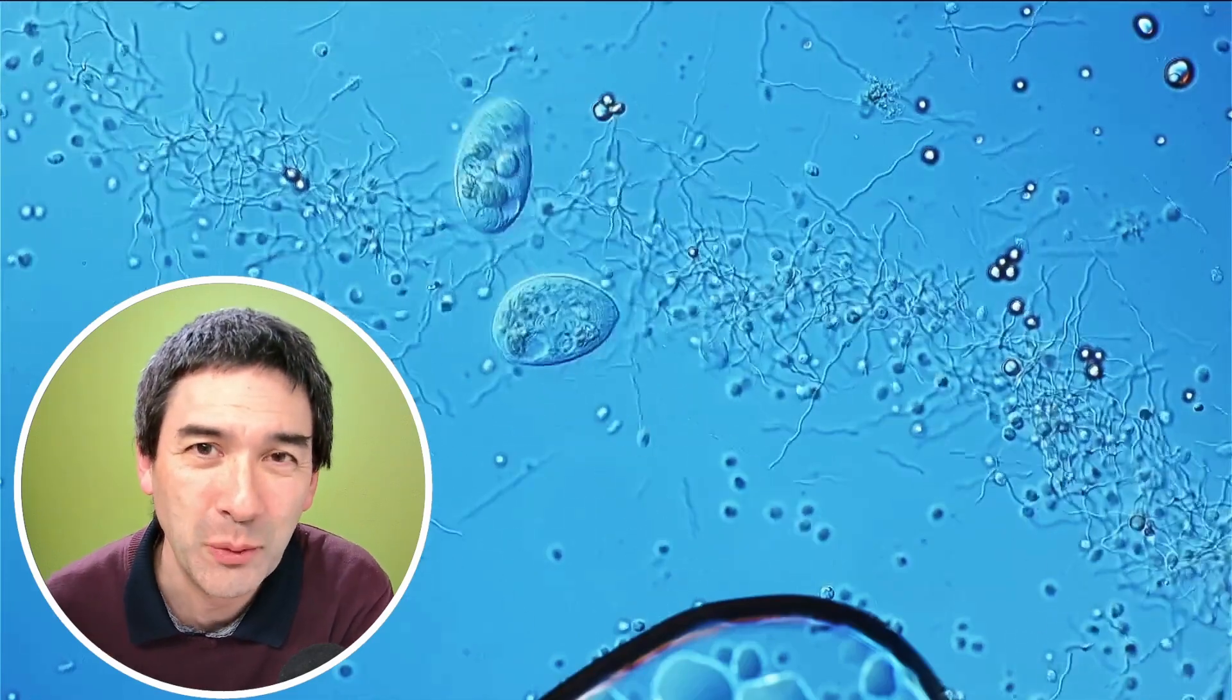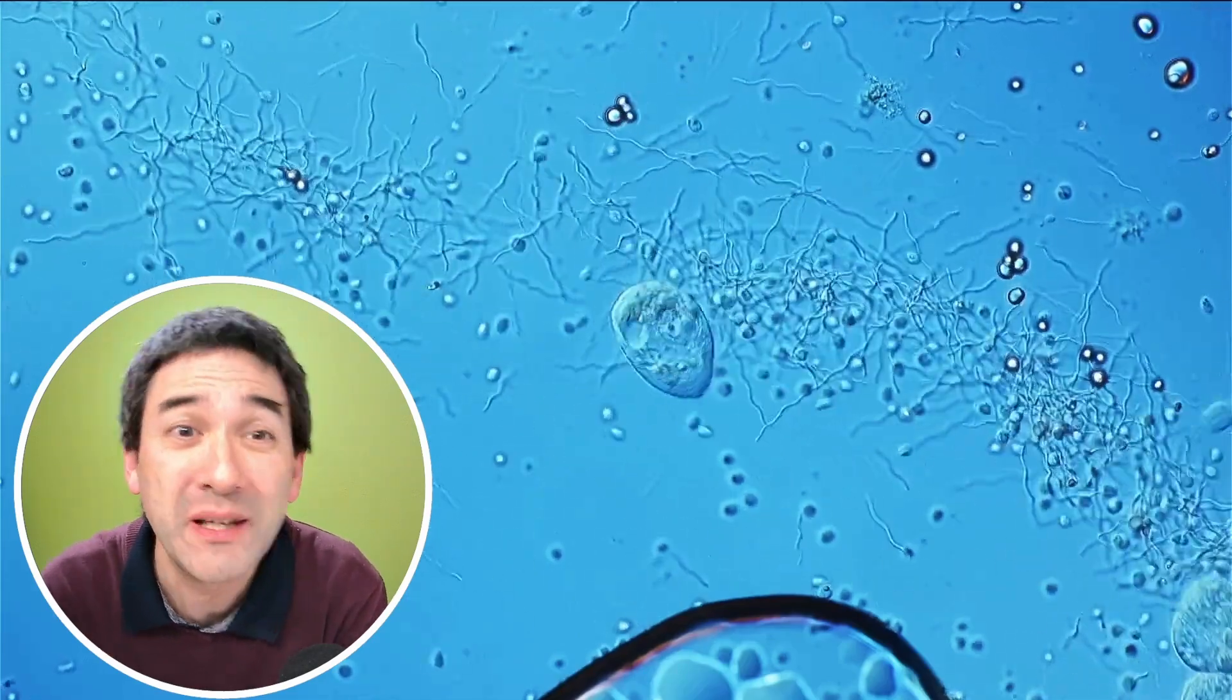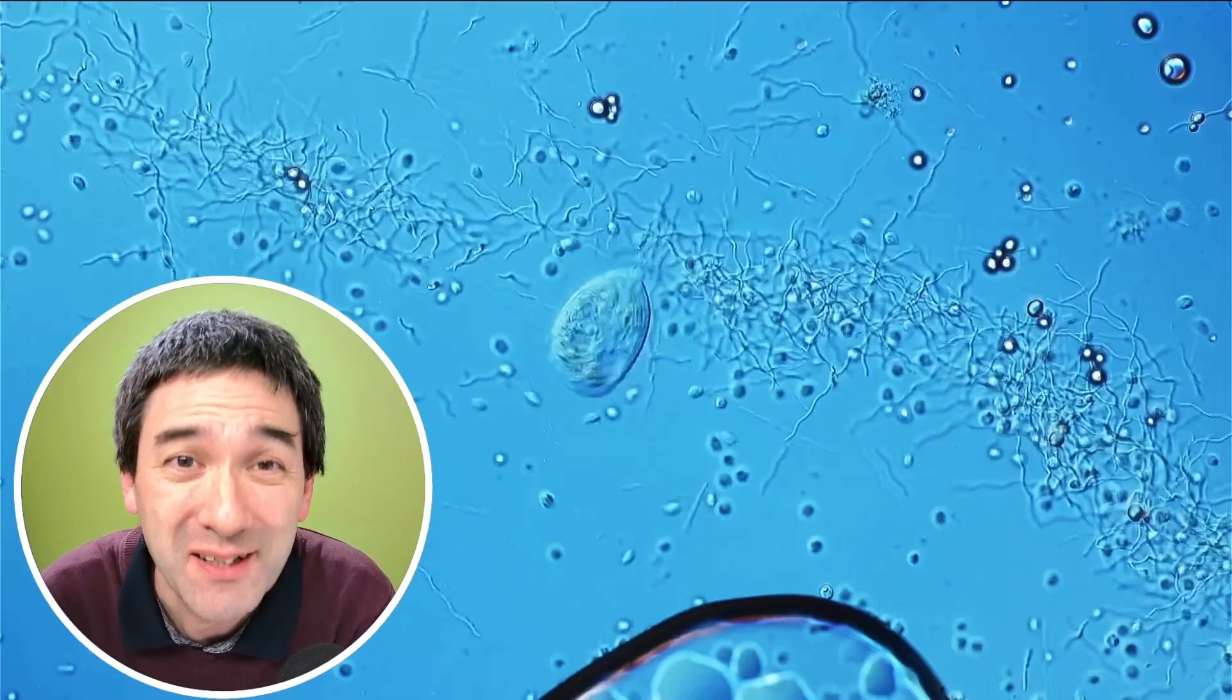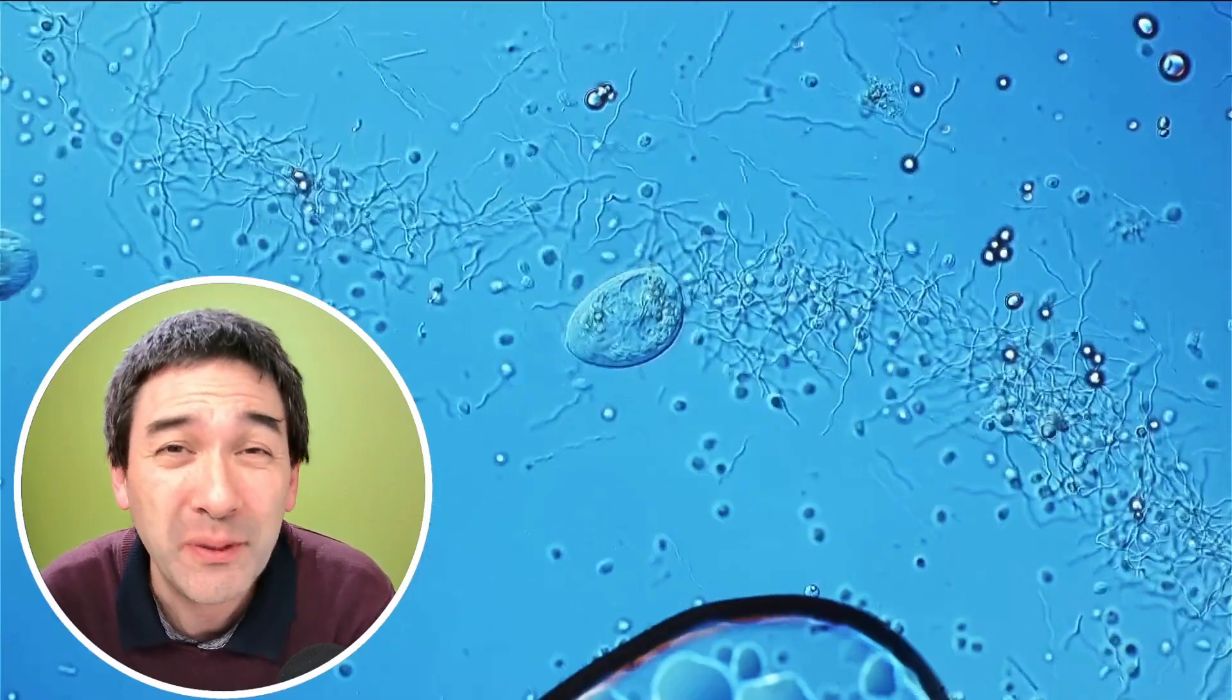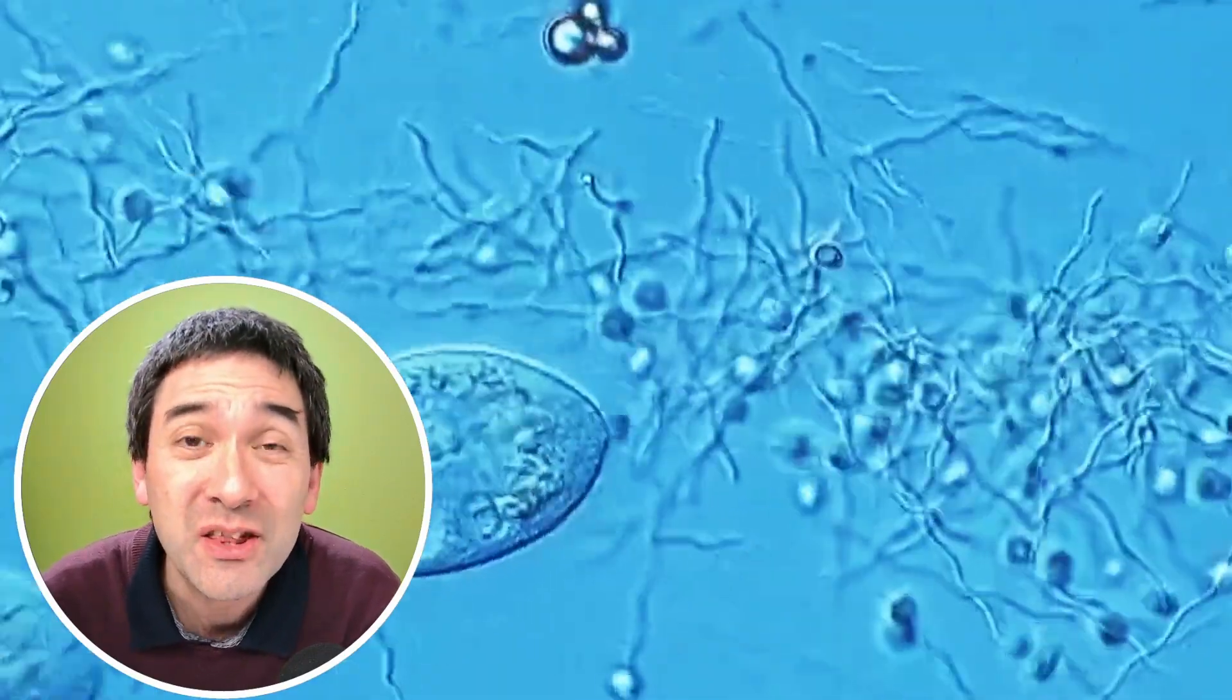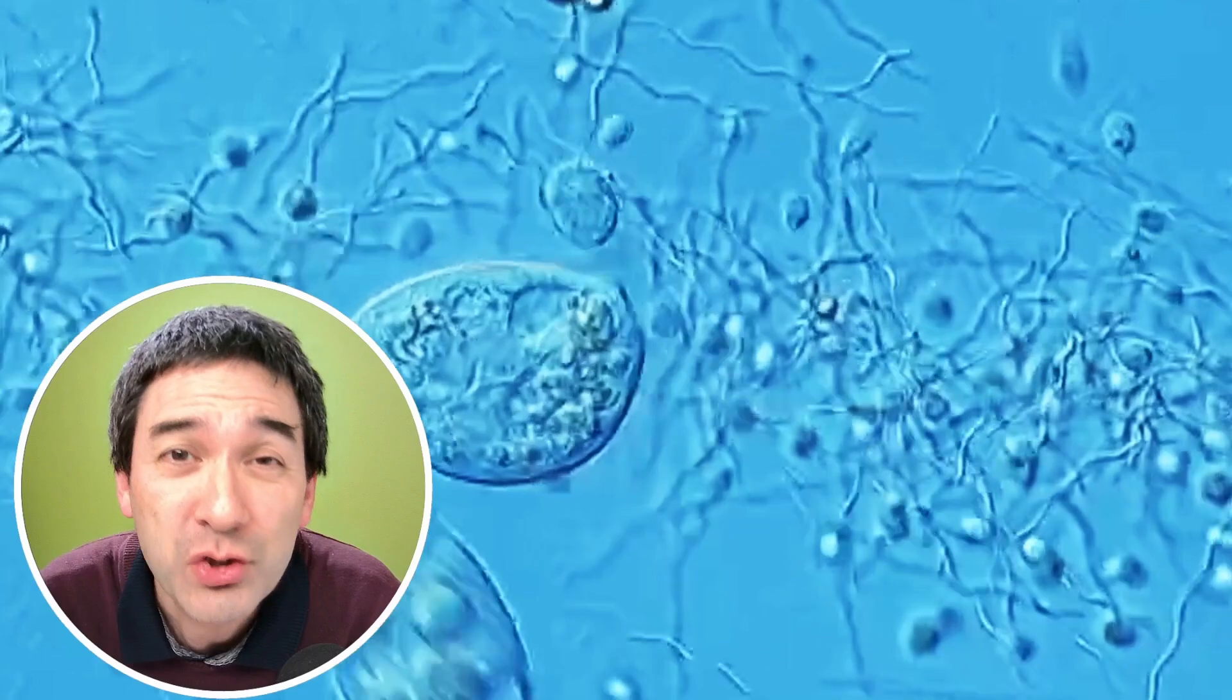Hi, Micropunter here again. Look what I found here. These are spirochetes, and I'm not talking about those big cells that you see swimming around here, but those tiny thread-like spiral-shaped structures.